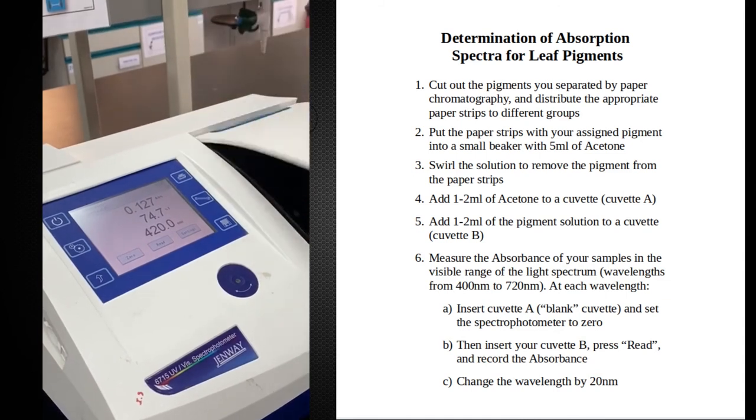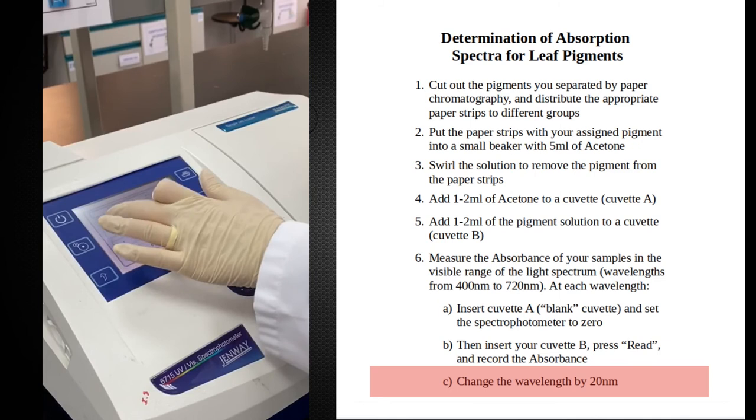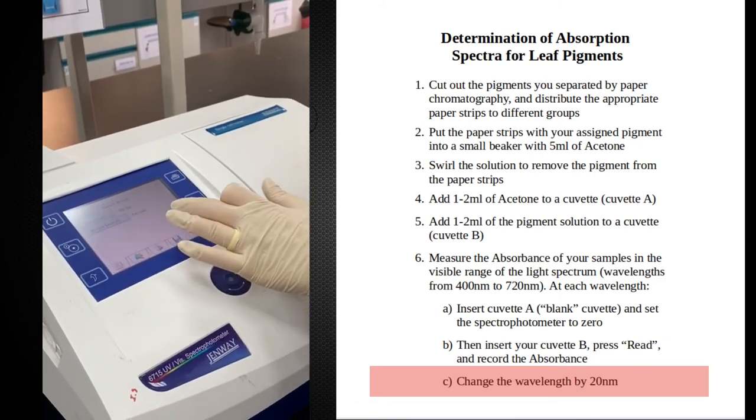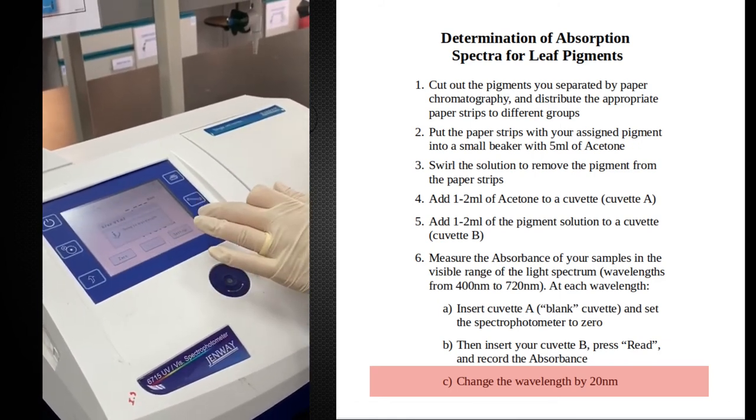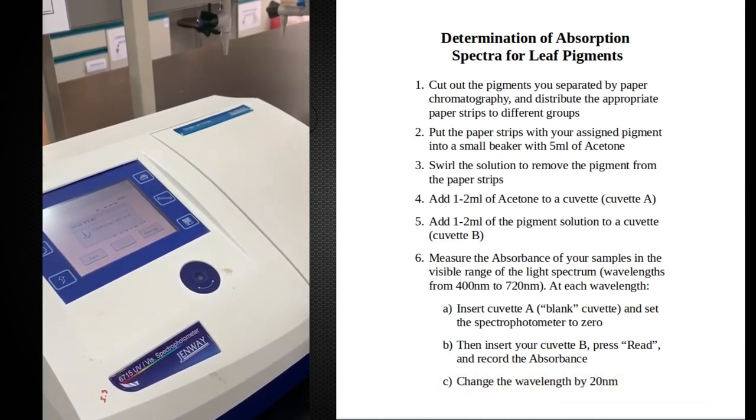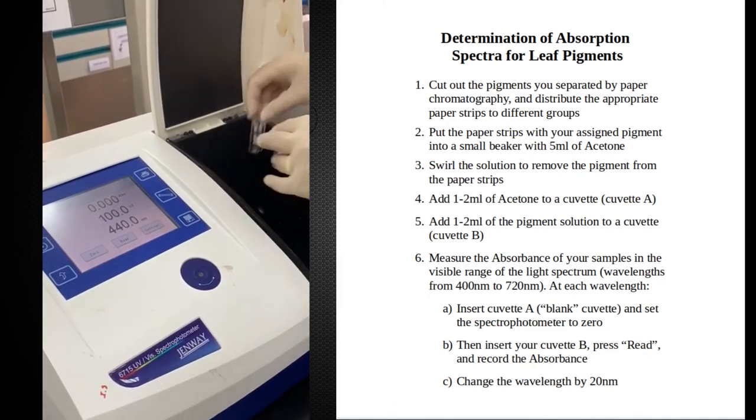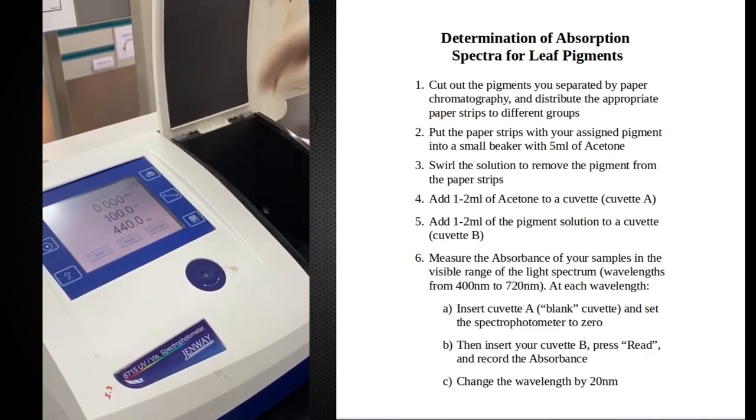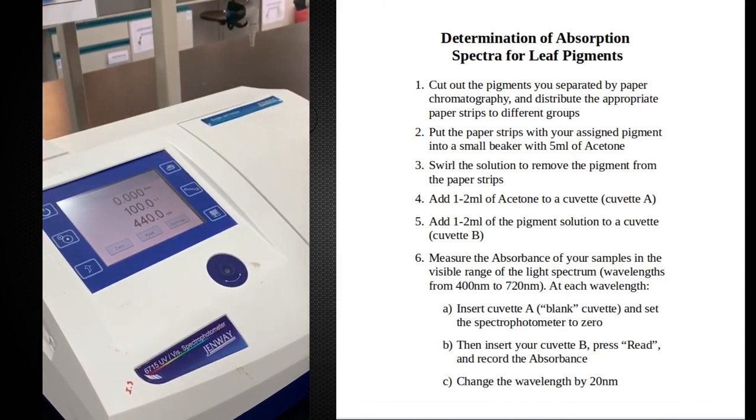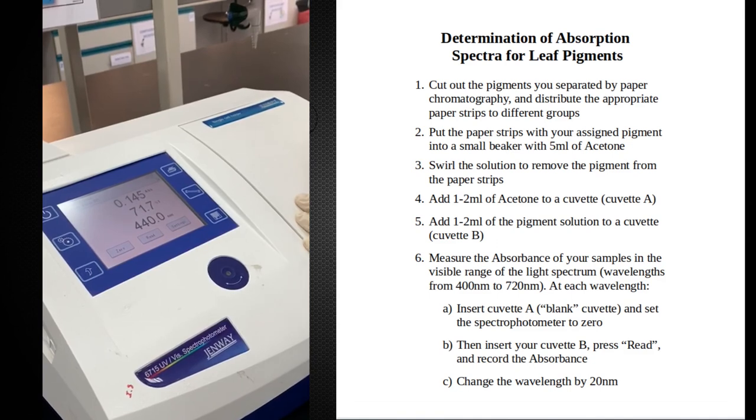So I reinsert the blank, which is the acetone. I set the wavelength, 440 this time. And then I zero the spectrophotometer. And then I read the absorbance, 0.145.